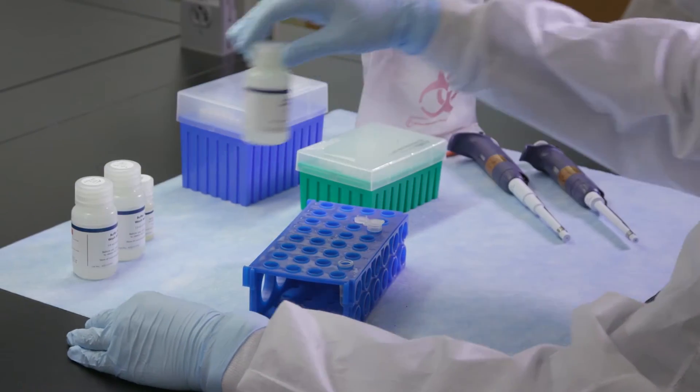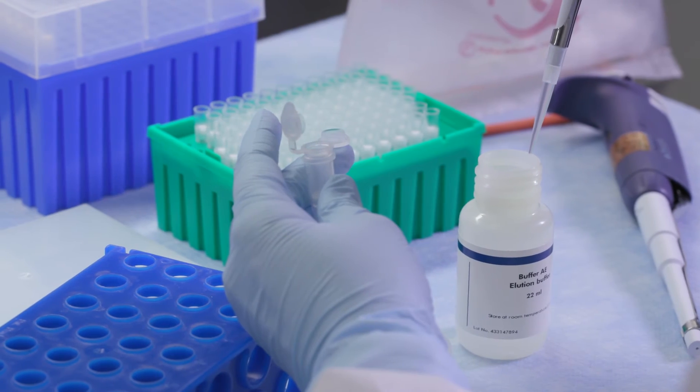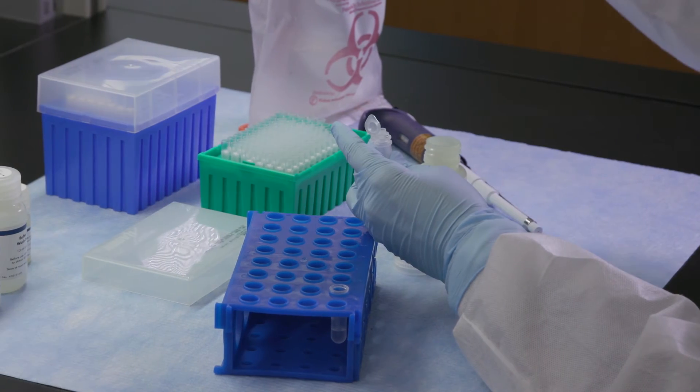Finally, apply an appropriate elution buffer or water to release the nucleic acid from the solid matrix into a collecting container.